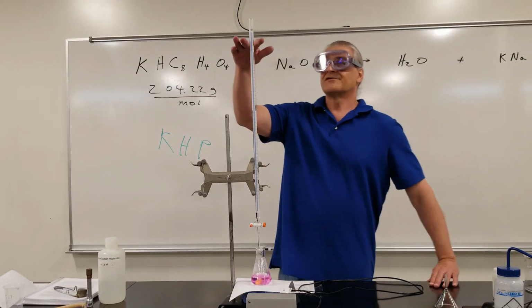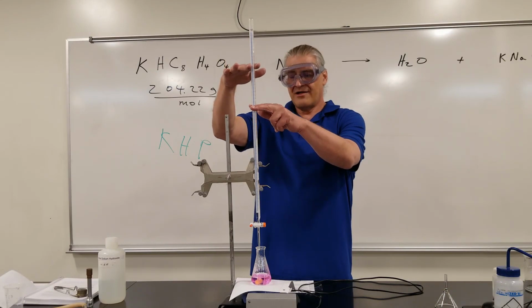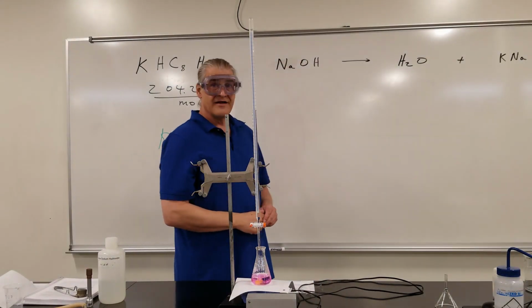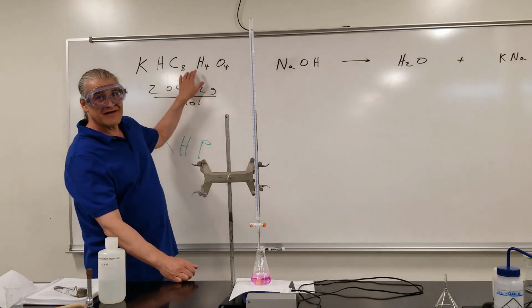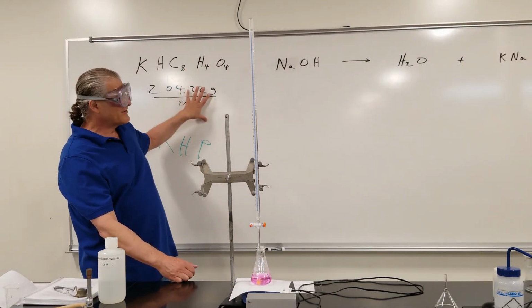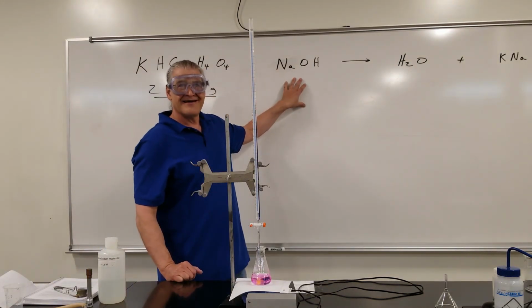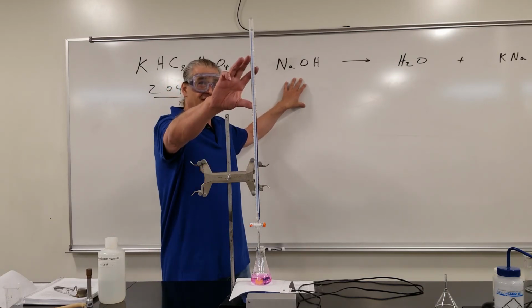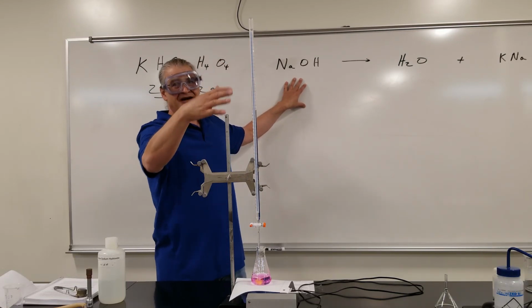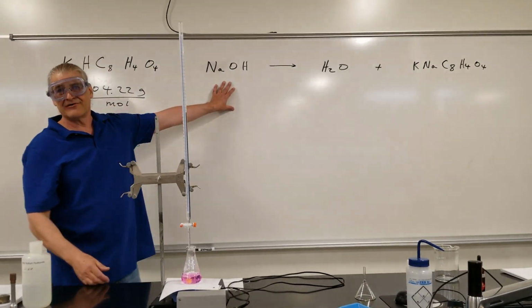So, you take the initial reading, the final reading, that's the total volume of sodium hydroxide that was used. And again, I know moles of KHP because I weighed it. So I can calculate moles of KHP, which is equal to moles of sodium hydroxide. So I know how many moles of sodium hydroxide were contained in this volume. And again, moles divided by liters will give you the precise molarity of that sodium hydroxide solution.